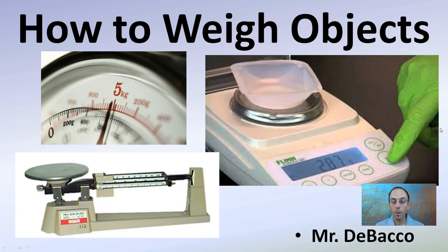Here I'm going to go over how to weigh objects, which might seem rudimentary. I'm not going to focus on the triple beam balance. We're going to focus more on a digital balance, which might seem easier, but does have its certain quirks and proper procedures to follow.